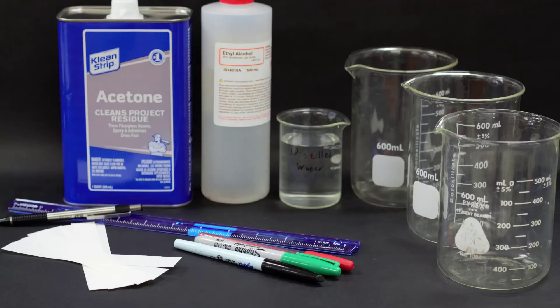For our materials, we'll need to start with distilled water, ethanol, and acetone. Those will be our three solvents, so those will be what you want to look up on Google to try and figure out what the polarity of each one is.